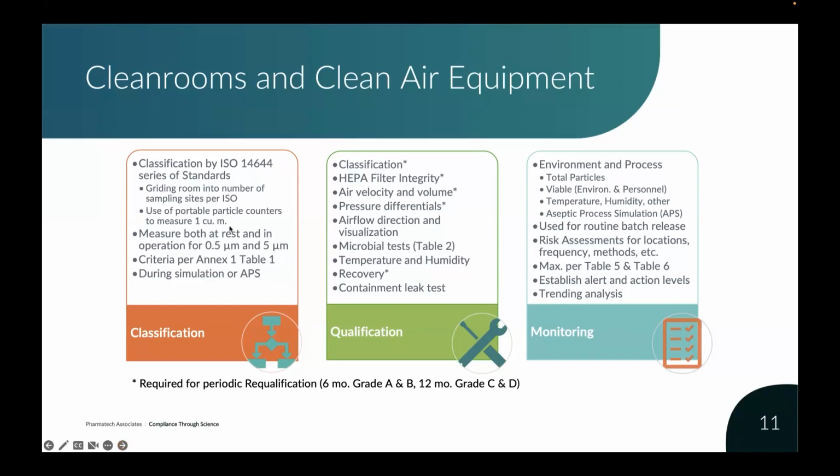the ISO 14644 series, essentially the clean room standards. So this is applying the standards to measure the total particulates in a particular clean room. That starts by applying the formula for determining the number of sampling sites based on the square footage of the space per the ISO. So you grid out the room. Within each grid, you put a portable particle counter.